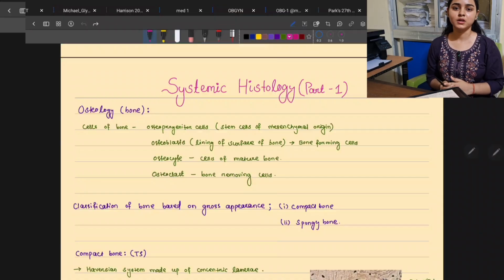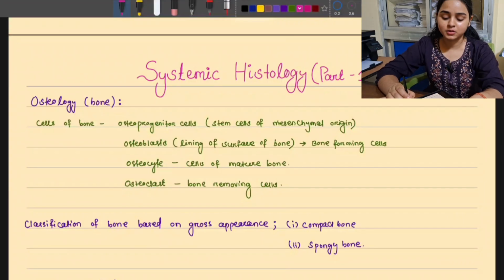Today we are going to cover digestive system and bone वाला पार्ट, क्योंकि bone मैंने जनरल हिस्टोलॉजी के वीडियो में नहीं कराया था. So let's get started with the histology of bone first.